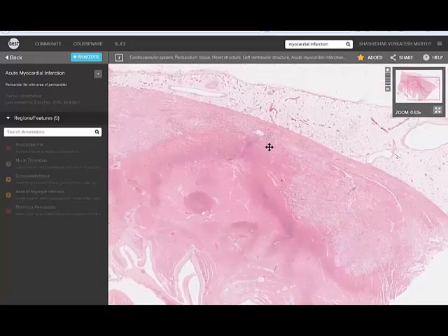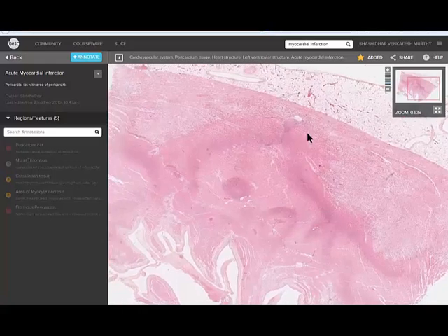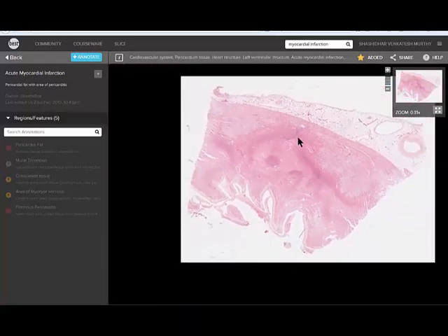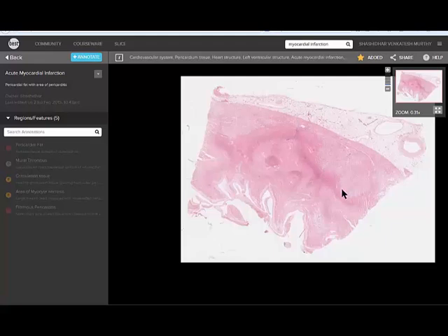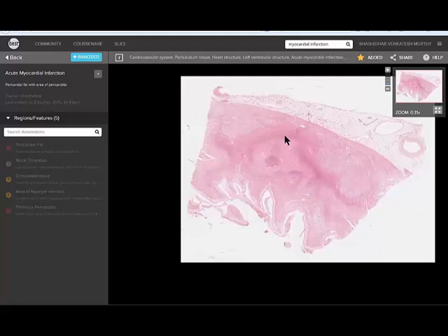The myocardium, if you observe, there is a dark area band here. And outside of this band area, which is darker red in color, compared to outside which is paler in area. Understanding microscopy, dead tissue, first change to be seen is loss of nucleus. The blue or the purple color is lost in a dead cell.